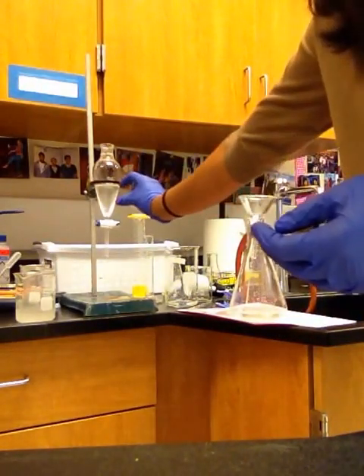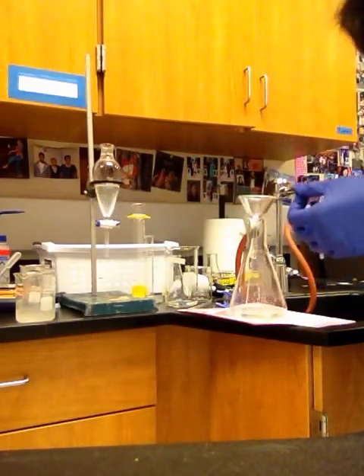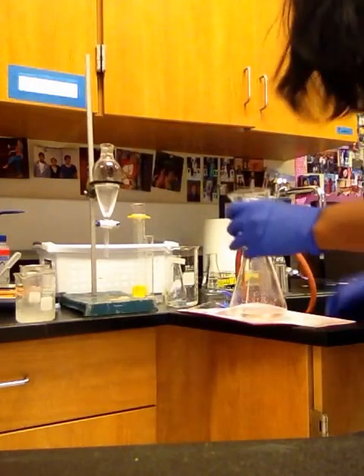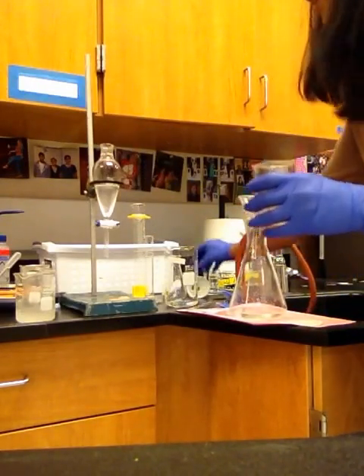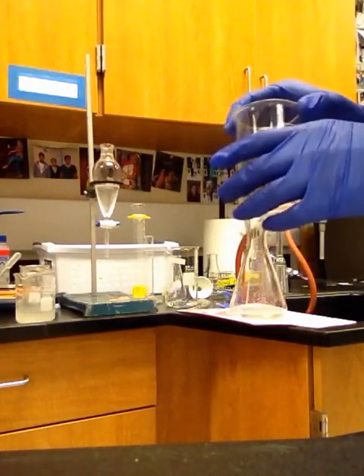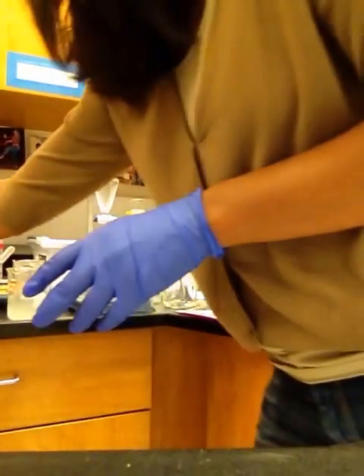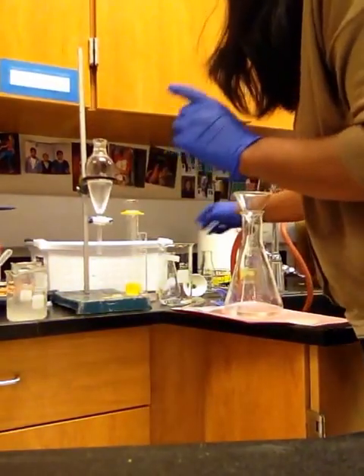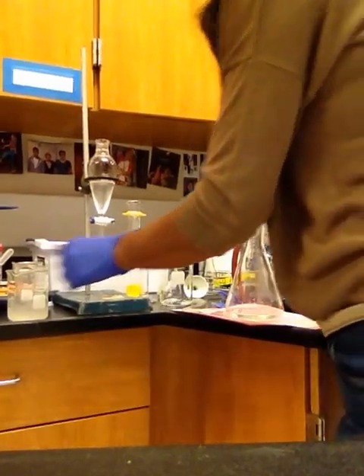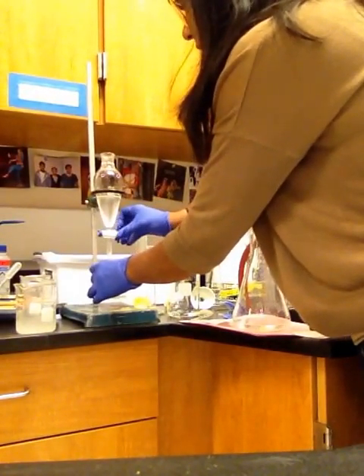Now the last component is acetaminophen, which is present in the ethyl acetate layer. You take out the ethyl acetate in a pre-weighed beaker. It is important that you take it out in a pre-weighed beaker because we're going to evaporate the ethyl acetate. Okay, but before that there is one more step. So you take out the ethyl acetate. I'm running quite out of beakers here. You take out the ethyl acetate layer.